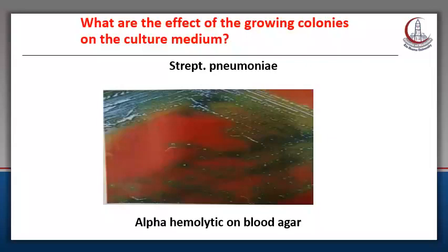First, if the result on the blood agar, in this picture in front of you, is greenish color around the colonies, it's called alpha hemolysis on blood agar or partial hemolysis, as the incomplete hemolysis of the blood leads to intermediate products of the hemoglobin, causing the greenish discoloration around the colonies. Okay, we should suspect Strep pneumoniae. Yes, Strep pneumoniae is causing partial hemolysis on blood agar.